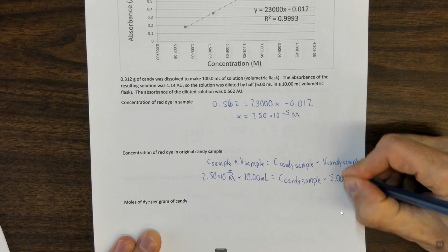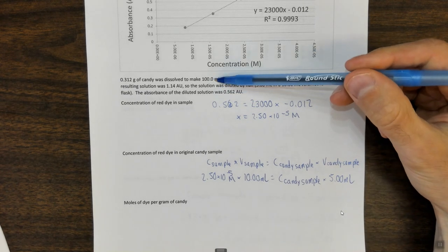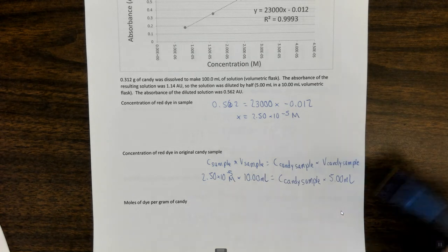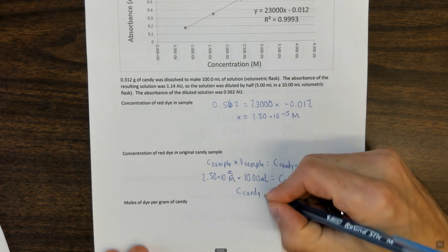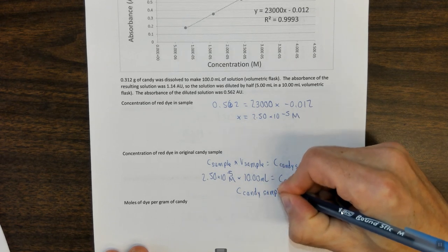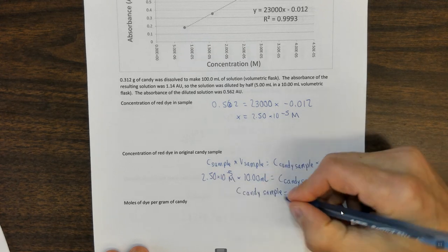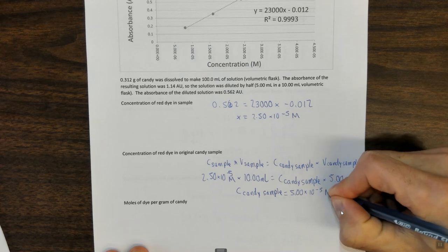Here I used 5 milliliters of the original candy sample, which again was diluted in 100 milliliters. We'll take care of that in a minute. When I do that, I find that the concentration in the candy sample was double the concentration in the diluted sample, which is 5 times 10 to the minus 5 molar.